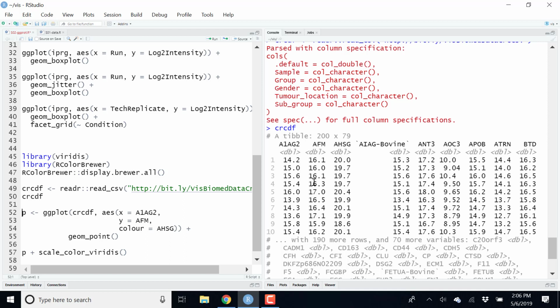So we already had this in IPRG, right? This whole data set. What's the reason that we are creating another CRCTF? So this is another data set. This is the CRC data set, and that's the IPRG data set. That we actually already also had this morning. So this same line of code, we already had it this morning. Sorry. Okay, so I got it. I thought that it's.